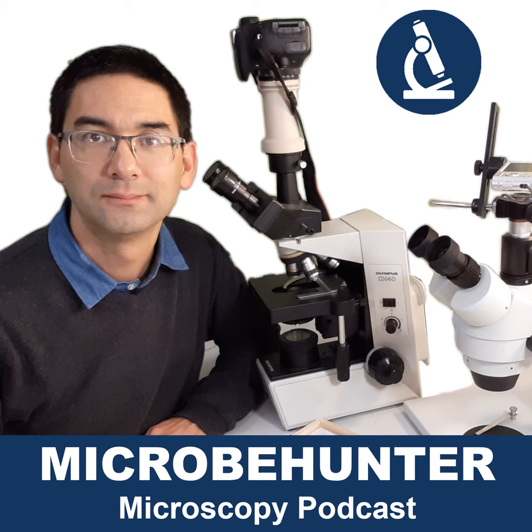Okay. It really depends a little bit on what your interests are and whether you want to take pictures, because if you want to take pictures through the microscope, then for some objects, of course, you want to have a little bit more flexibility in magnifying the things that you look at. But let's now have a more detailed look at the objectives that come with a microscope.